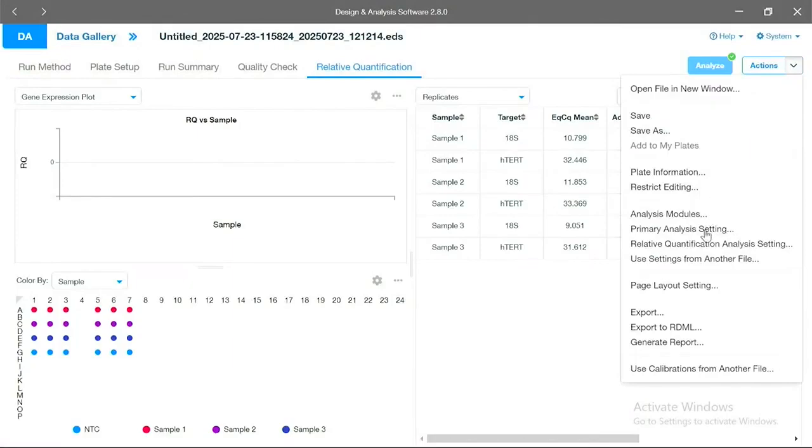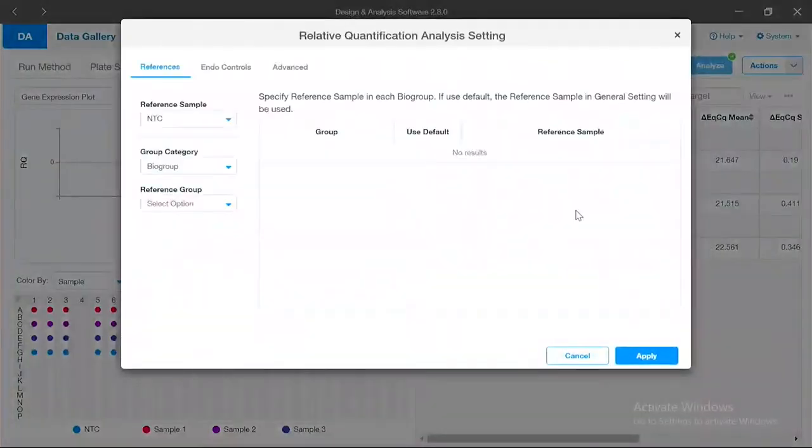Next. Oh, we're getting somewhere. My table changed. Okay. At the same time or separately, we can now assign which sample is going to be my reference sample. I'm going to pick number 1. I don't have a preference. We can change our mind later.